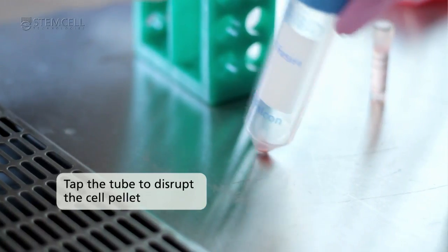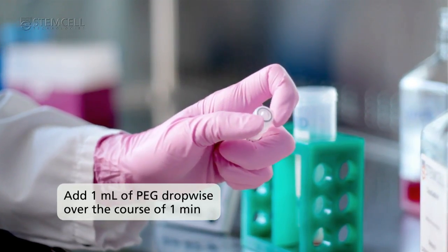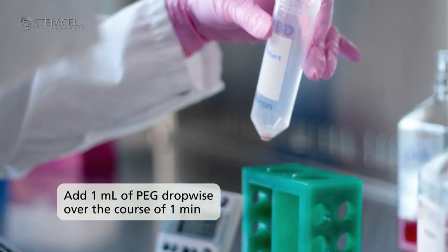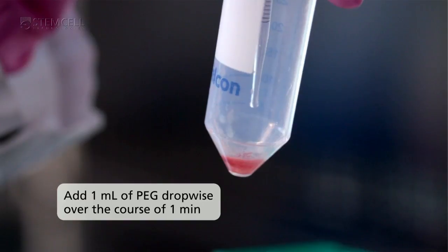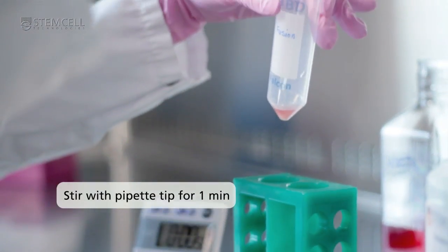Tap the bottom of the tube to disrupt the cell pellet. Add 1 mil of PEG drop-wise using a 1 mil serological pipette. The PEG should be added over the course of 1 minute with no stirring. After addition of PEG, stir with the pipette tip for 1 minute.